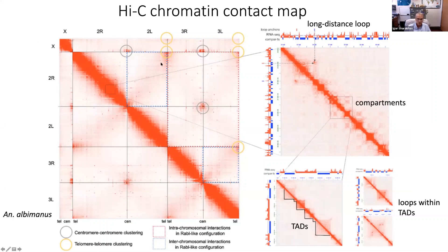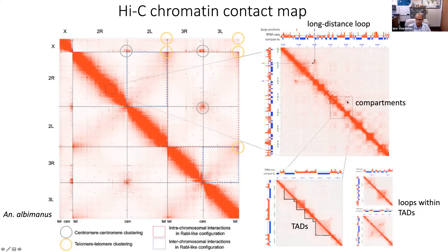You can see interactions between right and left chromosome arms suggesting Rabl orientation. Zooming in on one of the diagonals, you can see A and B compartments — which one is which can be told based on the RNA-seq profile, with A compartments being active and B compartments inactive. These compartments contain interactions between TADs, which can be visualized using special software. Within the TADs, loops can also be seen — recognized by bright spots representing loop anchors.